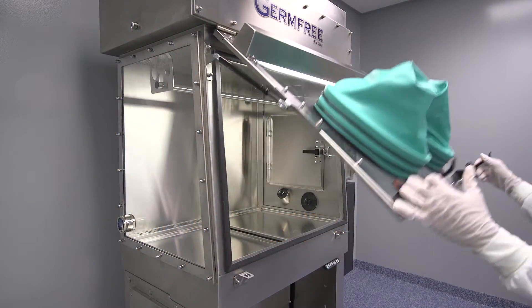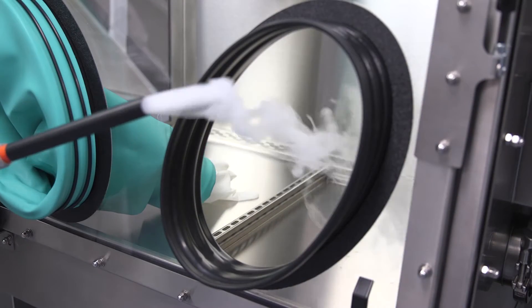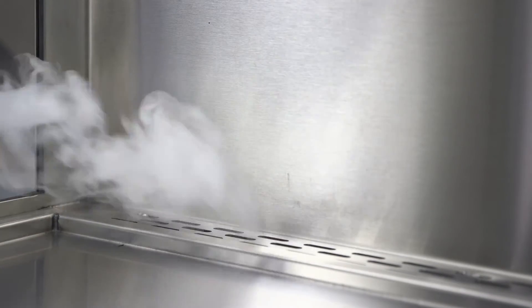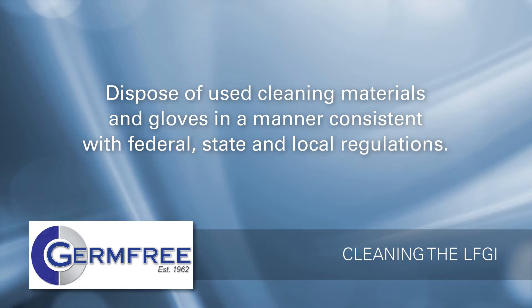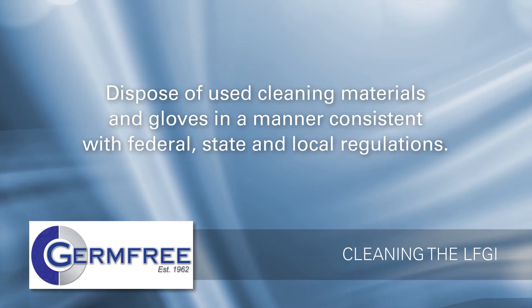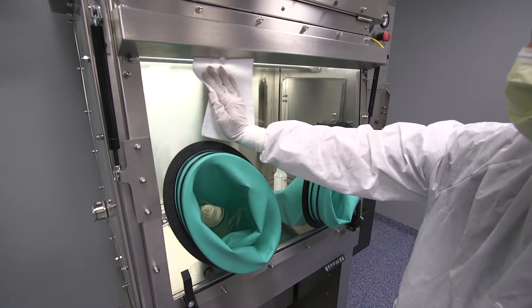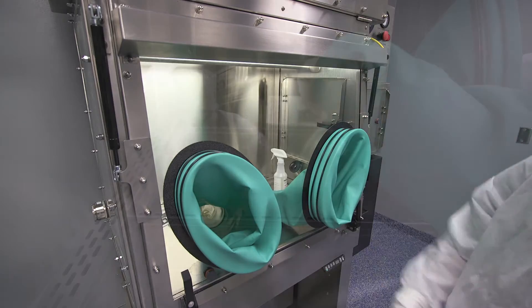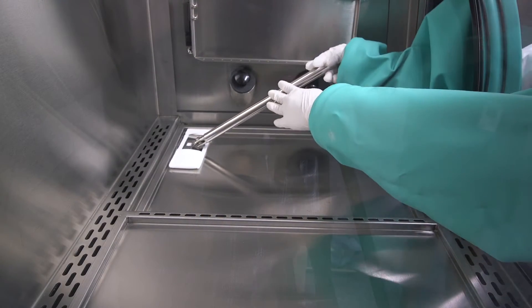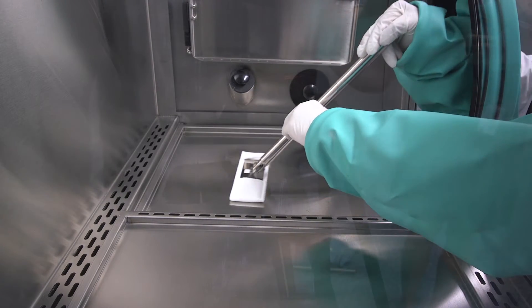This video covers how to clean a negative pressure germ-free LFGI. The unit maintains negative pressure within the work area to prevent materials being processed inside the LFGI from escaping into the outside environment. When cleaning, pay special attention to controlling the spread of contamination and dispose of used cleaning materials and gloves consistent with federal, state, and local regulations. A thorough cleaning is needed before the unit is put into service and regularly as required by your facility's SOPs. This video will address both the rigorous cleaning and a lighter cleaning to be performed between preparations.